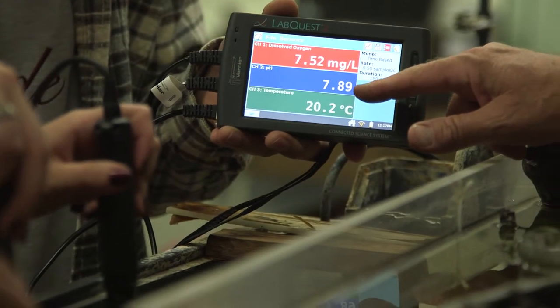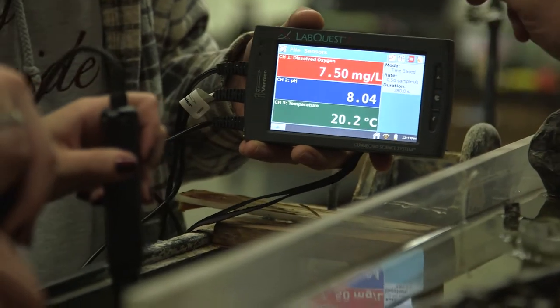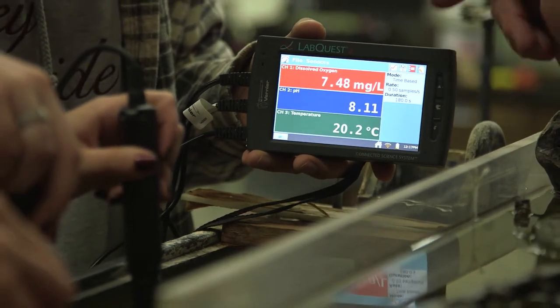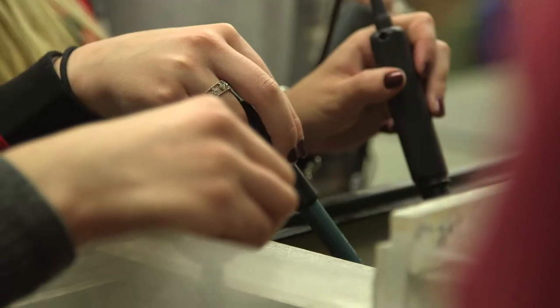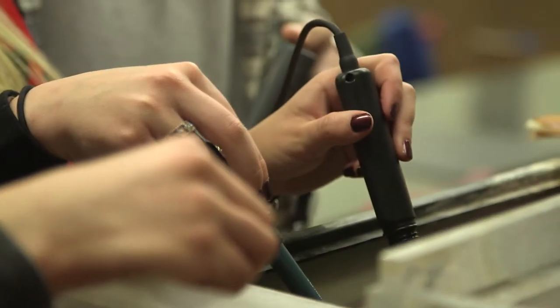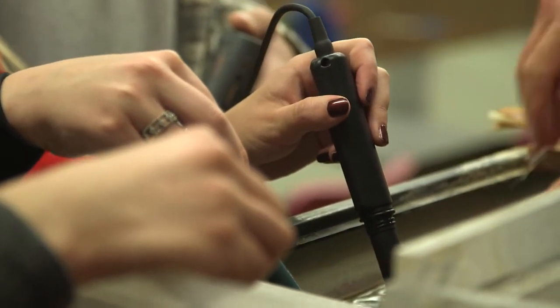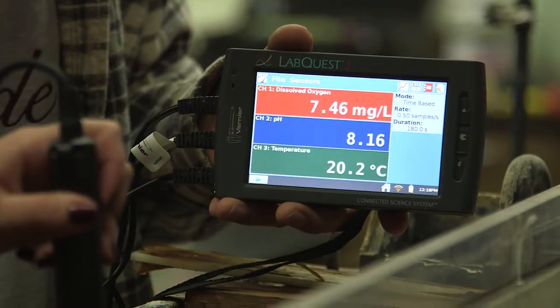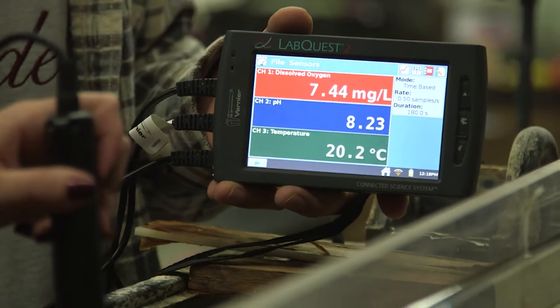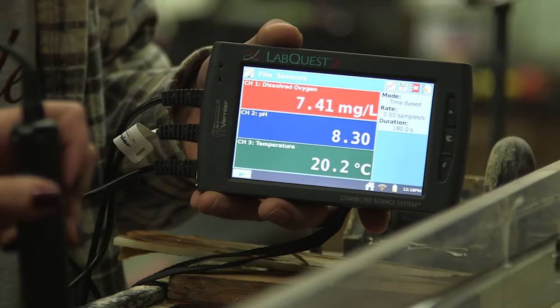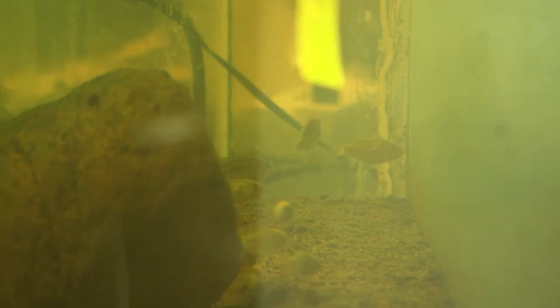pH is kind of neutral, more to the base side. Temperature is 20 degrees. What do you think will happen when I turn the stream back on? Dissolved oxygen is going to change — it's going to be higher. If you look from the side, what happens as the water is running in there? Bubbles. So it's pushing those bubbles down underneath the surface, and that increases the surface area in the mixing and allows the oxygen to be dissolved in the water.